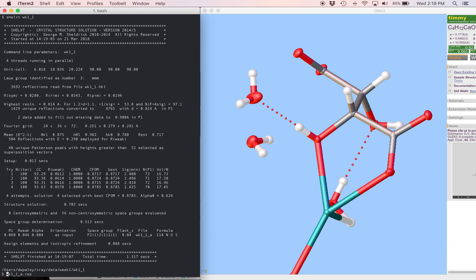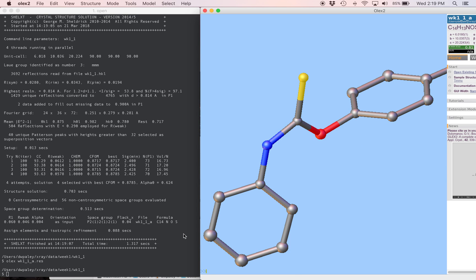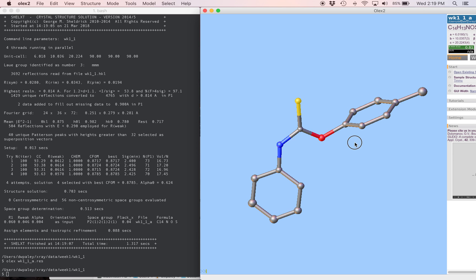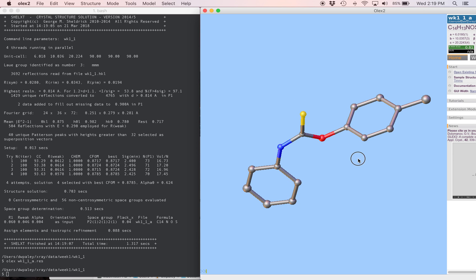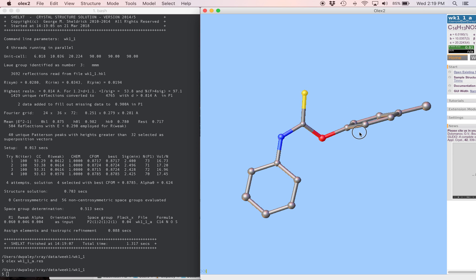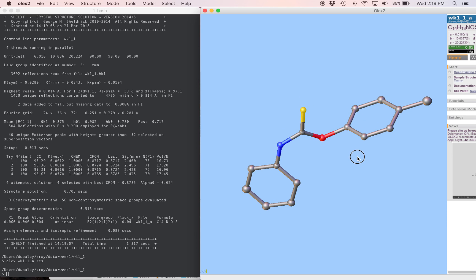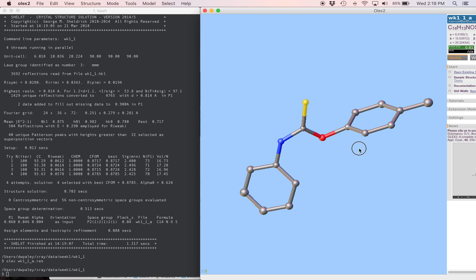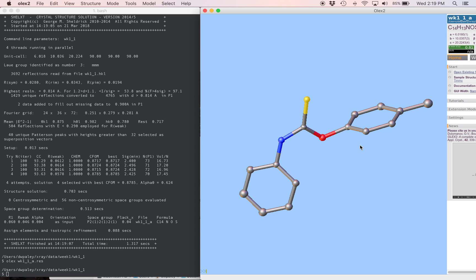And I'm going to open this in Olex. So we can see the output that we got from ShellXT, and clearly it's pretty good already. We have every atom type assigned correctly. If that wasn't the case, we could fix it at this point. But since we have the basic structure here, we're going to go ahead and name these atoms in a way that makes sense.